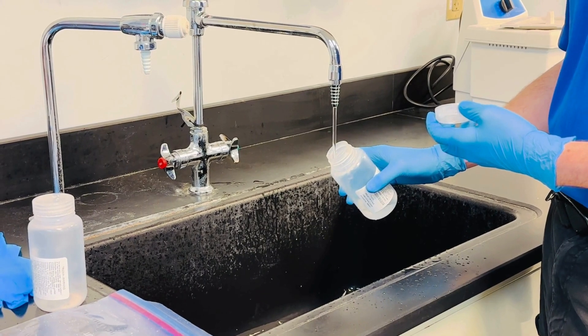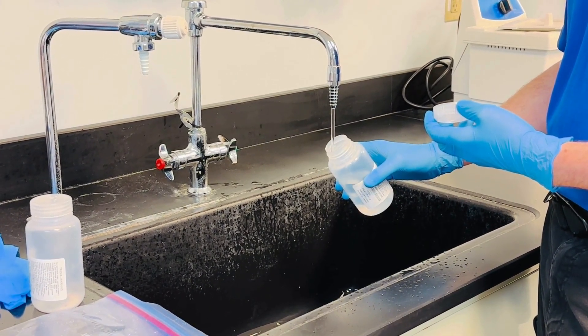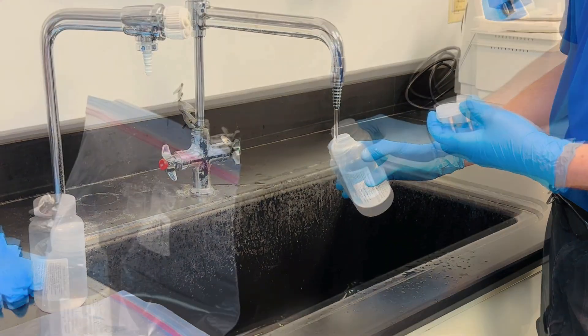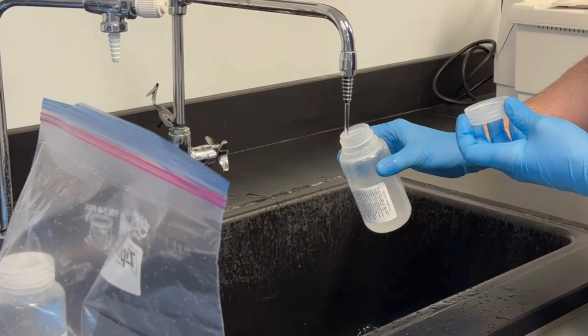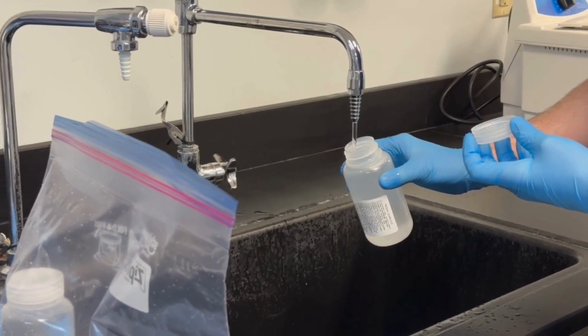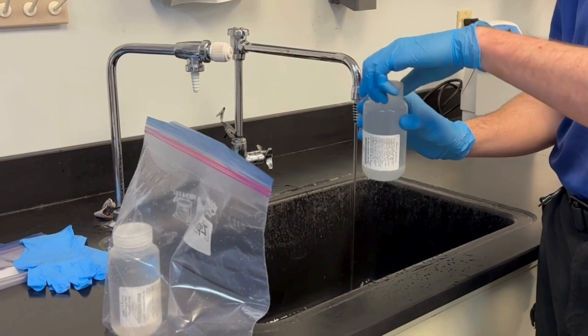Unscrew the cap from your sample bottle and keep it in your off hand or lay the cap facing up on the bag. Fill the bottle to the neck as normal, taking care not to overflow the bottle, which would wash out the preservatives. Recap securely and place the sample container directly into a fresh, clean Ziploc bag that we provide you.